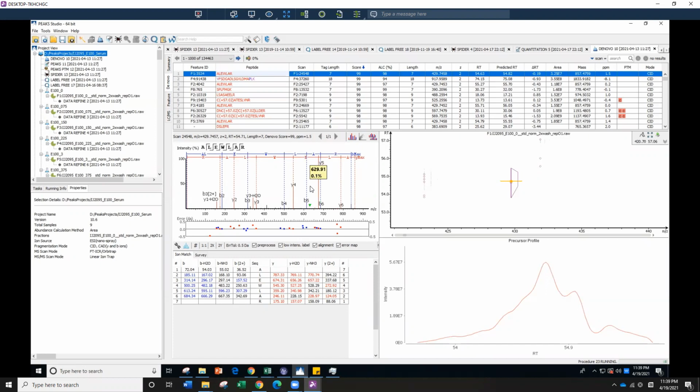Okay, so later on in biochemistry, like 583 if you're a biochem major, you will learn about how you're going to use MS, mass spec, to do protein ID. But the idea is we have an MS1 precursor, and we measure its M over Z once, and after that the instrument breaks it down into pieces using MS2, fragmenting this precursor further.